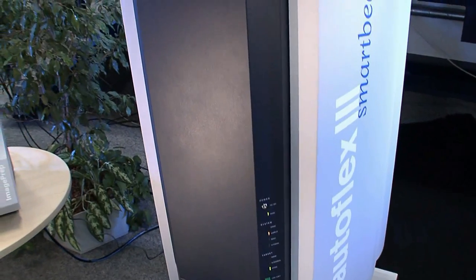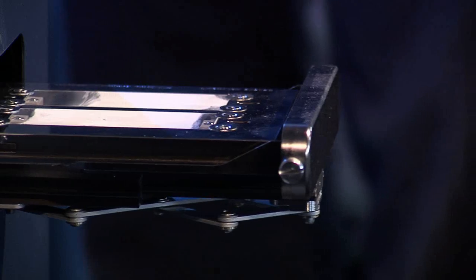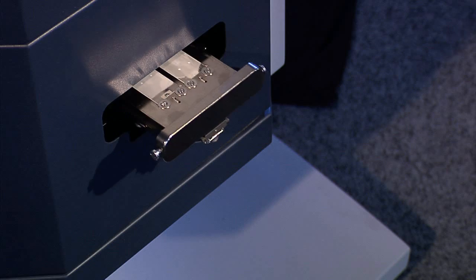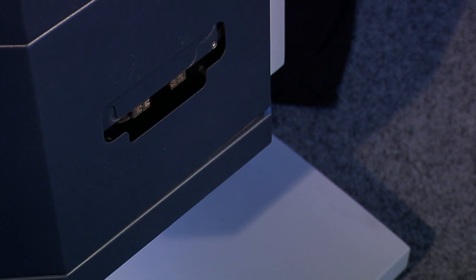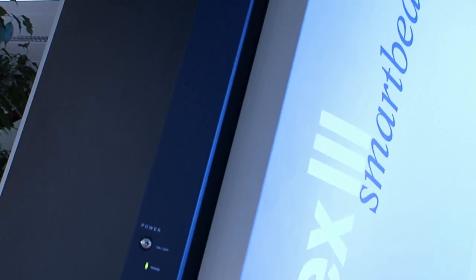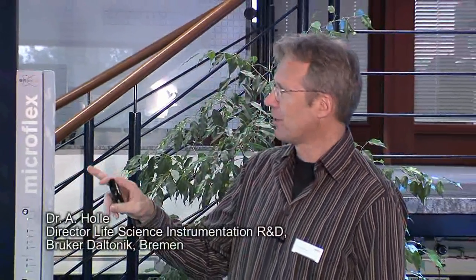The sample is measured by the Autoflex III MALDI-TOF system using its proprietary smart beam laser technology — a must for MALDI imaging and for superior resolution. Smart beam is a laser system including the optics which guides the laser onto the target, all optimized for MALDI-TOF. It's not just a laser; it's the whole integrated system.